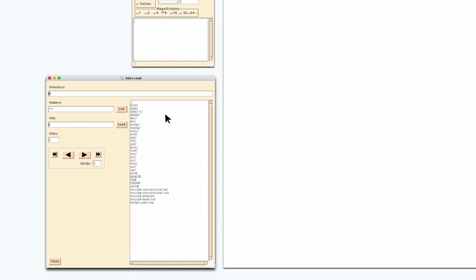Then go to Data 4, PROXIMA-1 Soleil, the current run number, the date, and your project folder. Images are in the raw data directory.